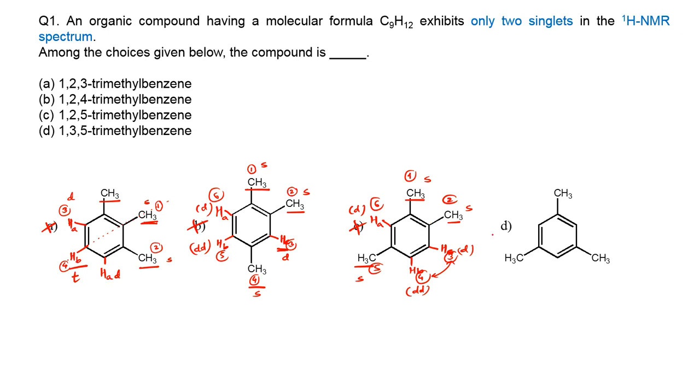So only one option remains. In compound D, we observe that the compound is symmetric. In all the cases we can find this symmetric nature. So all the protons of the aromatic skeleton are equivalent, and we can label them as Ha because they are equivalent. All these equivalent Ha protons will give a singlet. That means these three protons at the same chemical shift will give a singlet.